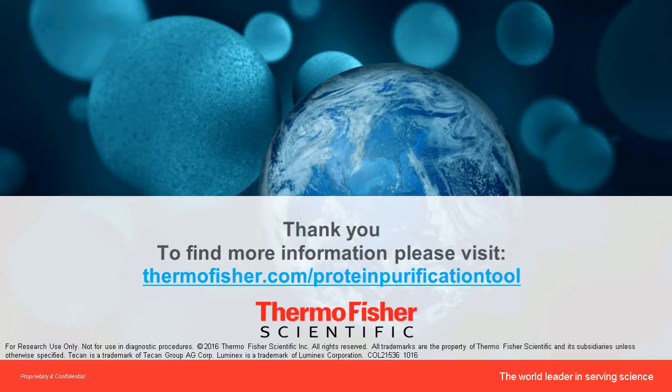Excellent. Thanks, Andreas. And our next question asks, would antibodies leached into IP eluates interfere with the downstream MS analysis? Is that something you can help out with, Bhavin? Yes. We spend a lot of time trying to keep the antibody bound to the beads, so you don't have any antibody leaching with this IP-MS protocol. What we found is that the only way you can retain the antibody on the beads is to cross-link the antibody with the beads, and then bring in your samples to form the antigen-antibody complex.